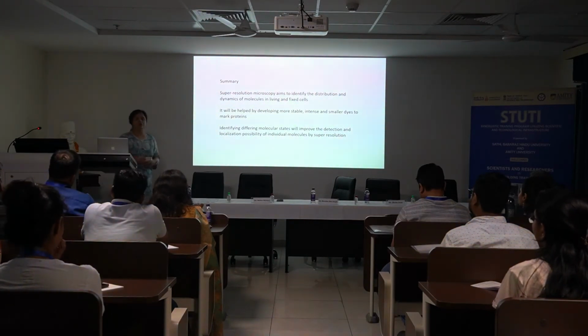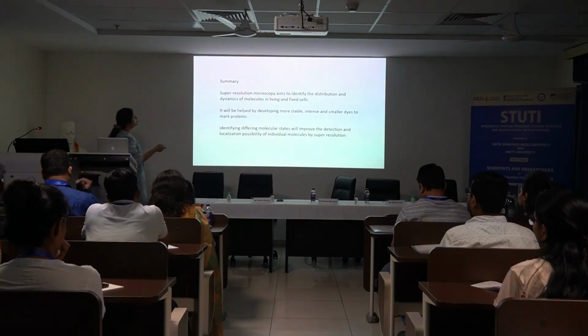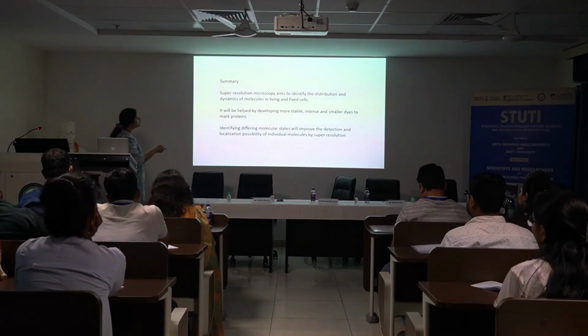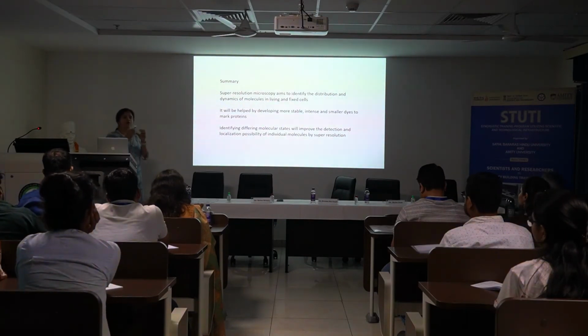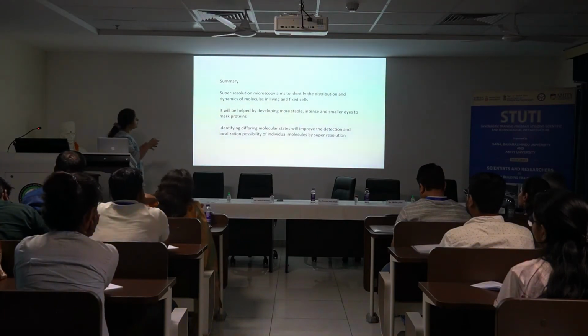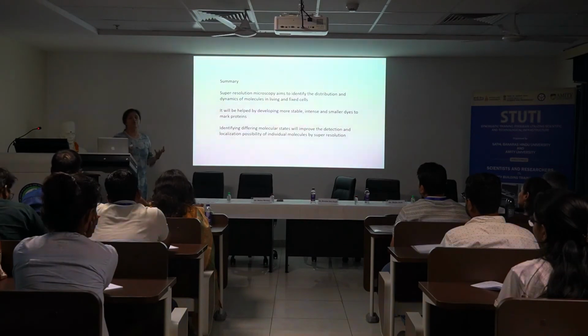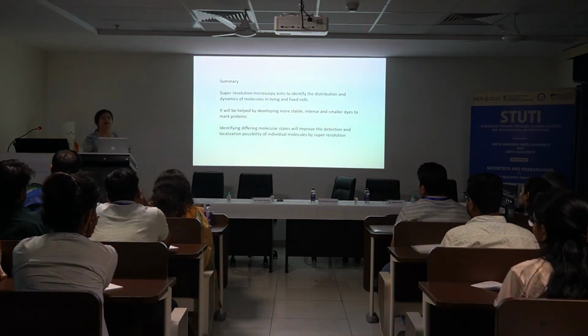Something which I have not shown in this presentation, but more and more has been a goal for STED as well as for PALM and STORM, is to look at the molecular dynamics of those single molecules which are being highlighted across these living cells, in addition to just fixed cells. And also for fixed cells, it's great because I can go up to 3 to 4 tags, and then I can coordinately localize them at a high resolution, right?